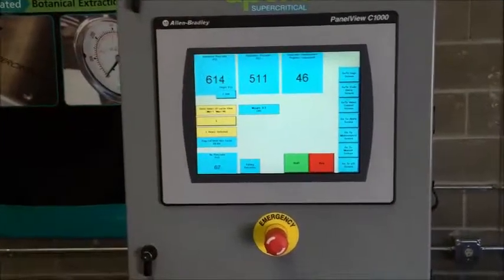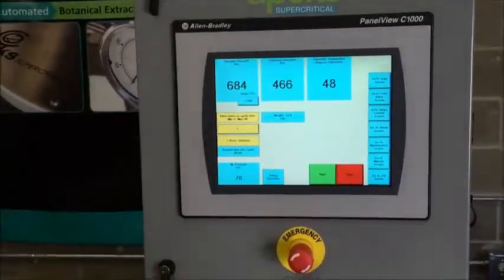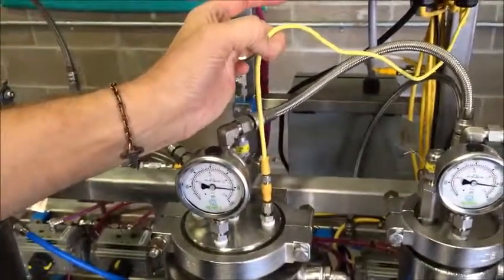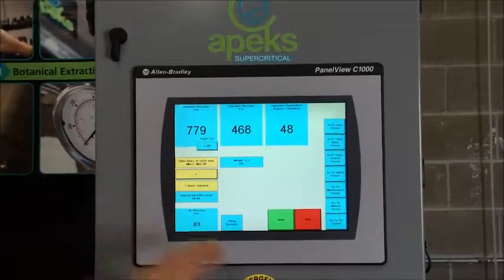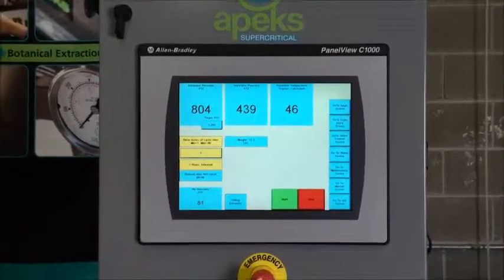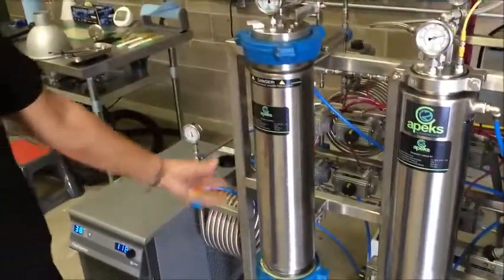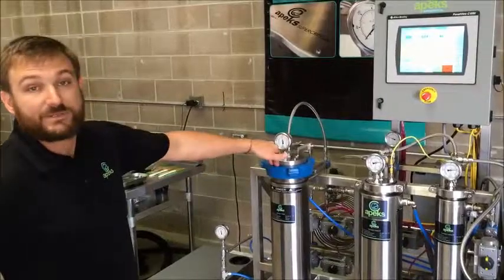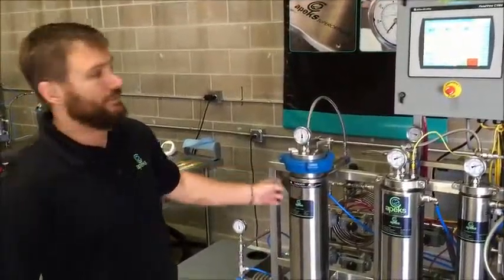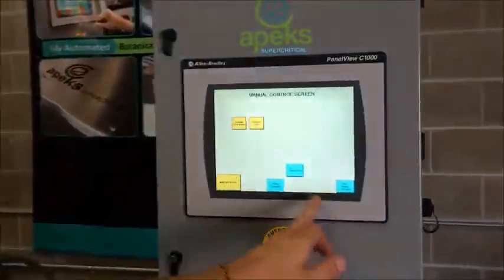Now as you can see up here, it's showing that it's filling the extractor. Here's our extractor pressure — this corresponds to this extractor over here. We have our separator pressure, which corresponds to both of our separators because they're tied together. Up here we have separator temperature, corresponding to the temperature inside our separator. Once this pressure reaches our set point, it will then go into forward or reverse flow mode — that just means the CO2 is either entering the top of the extraction vessel and leaving the bottom, or entering the bottom and leaving the top. Every run, the flow direction changes to keep the filters on the top and bottom from clogging.